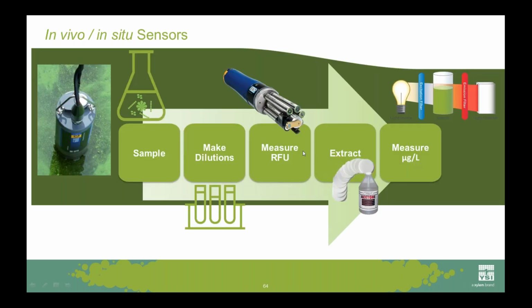That's all great, but a sensor, when we developed those units to deliver with the sonde, we did it in a lab. So when the parts per billion unit was developed, it was done with a laboratory grown culture that is diluted in a laboratory medium. This is grown with a constant intensity of light on a diurnal cycle, and then we perform that extraction. We measure RFU with the sonde, and then we measure it in a fluorometer and we build a correlation. That's how we deliver that unit to you.